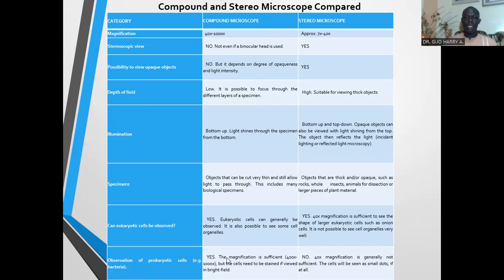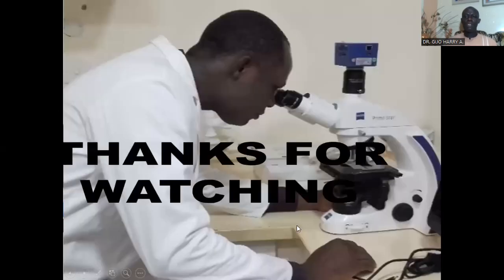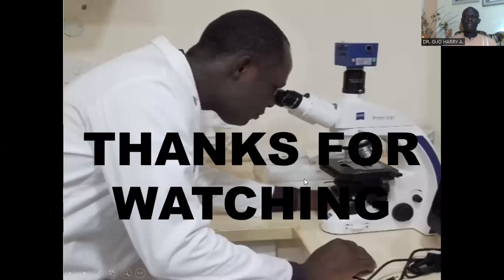It does not have as much magnification as the compound microscope. Then the compound microscope can be used to view prokaryotic cells like bacteria, while the stereo microscope cannot be used to view bacteria.